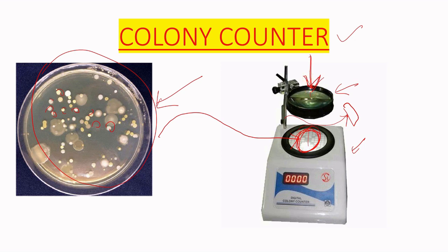Through this magnifying glass, we will see all the colonies. With this pen, we have to mark or press all the colonies one by one. As we press each colony, the count will be shown here digitally. After counting all the colonies, we will see the count.